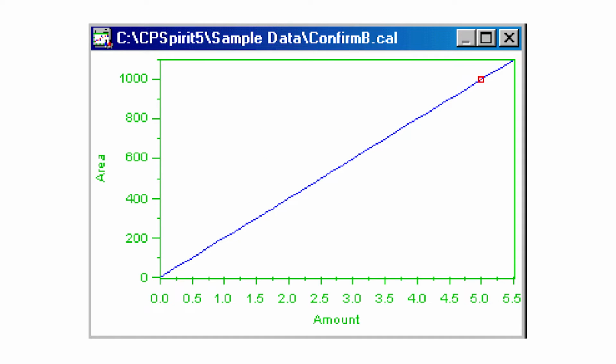In the illustration above, the amount is specified in a mass unit, micrograms, but the amount could be specified in terms of concentration as well. In theory, if the injection volume is not excessive, the detector will respond to the mass of each component, rather than its concentration. In practice, however, chemists often prefer units of concentration.